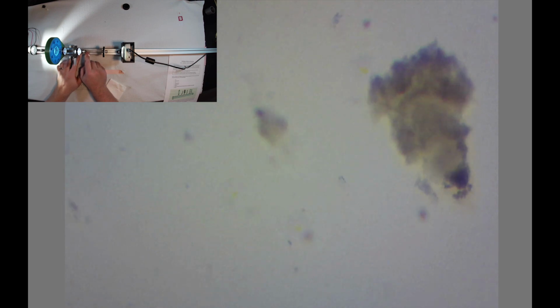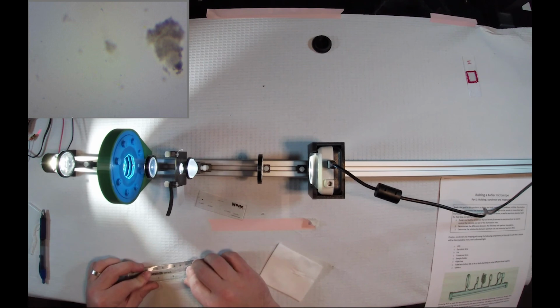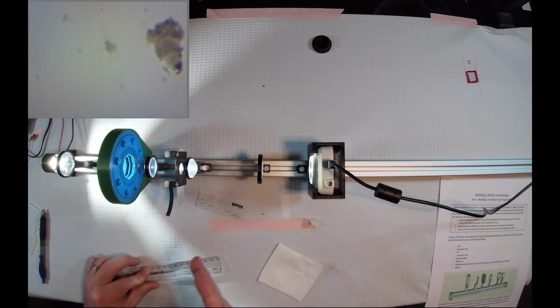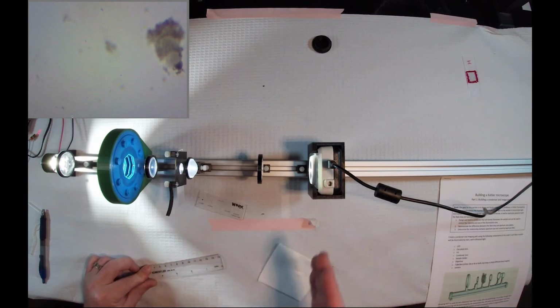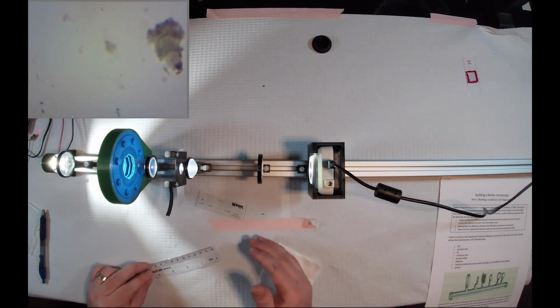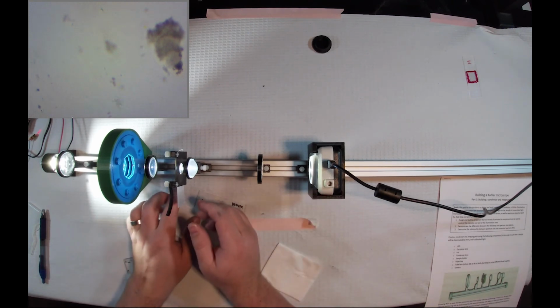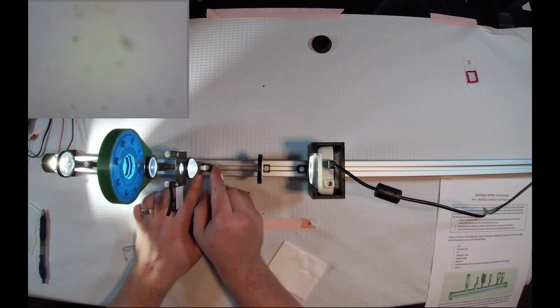So, again, you do see a negative contrast here, where your background is very bright and your sample is typically very dark because it acts as effectively an absorption filter for the illumination light as it passes through the sample. By the time it gets to the image plane, you're looking at a decreased intensity of light where there is something in your image plane and a brighter background where there's not anything. So very good for things that absorb light.